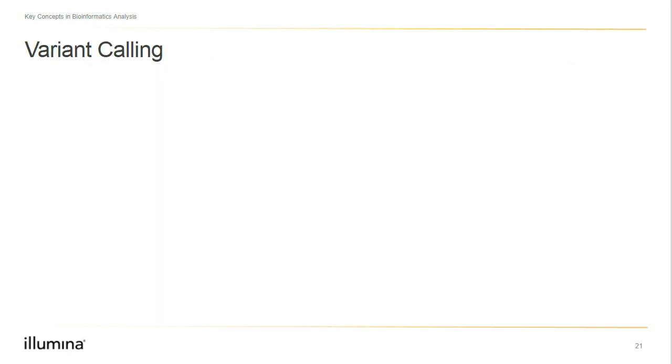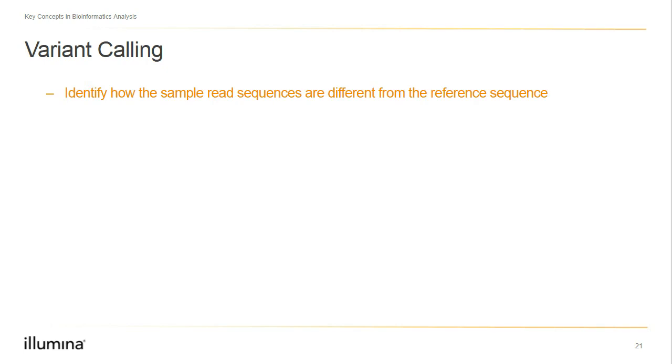We've already alluded to variant calling a bit in the previous examples, but let's go ahead and dig into this a bit deeper. After completing alignment, we want to understand where the samples are different from the reference sequence. We can have small point differences like in SNPs or larger deletions and insertions of full sequences. We want to make sure we are detecting these variations as much as possible in our samples. Again, as mentioned earlier, the output files are VCF or variant calling files and GVCF for genome VCF files.